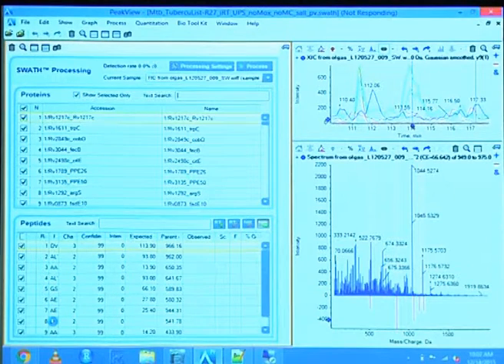Okay. So as you've seen here, the retention time doesn't match. This one here is the iRT retention time, so that's why it's about 50 minutes off. Also, since there are negative values, you see this one here. Somehow the graphical user interface doesn't like negative values and just doesn't display that.